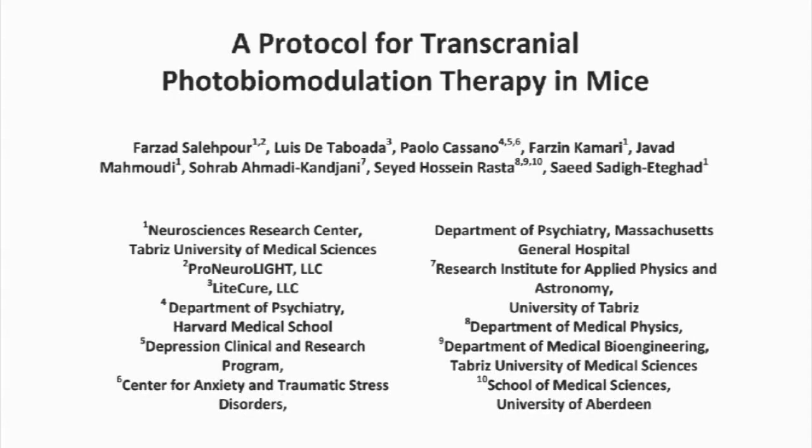The overall goal of the following experimental protocol is to perform transcranial photobimodulation therapy using low levels of red laser in mice. This is accomplished by the direct contact of the laser probe on the mouse head.